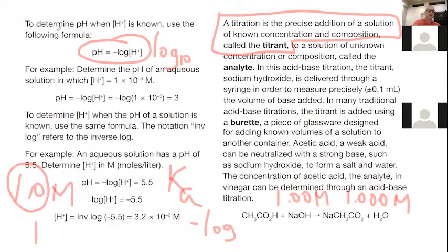So since we're using sodium hydroxide, we're using base. If the titrant is a base, then the unknown solution is going to be an acid. And we call that the analyte because we're analyzing it.